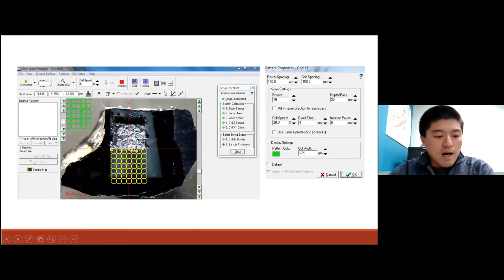And here's a look at the user interface. There's a system checklist for calibrations. And this snapshot shows an array that's just been excavated and a second array that's just been plotted.